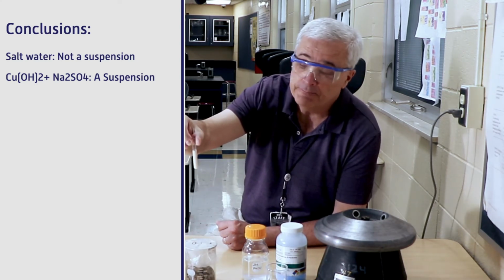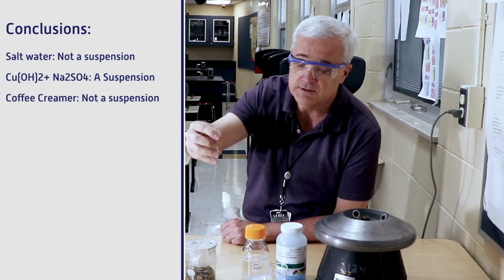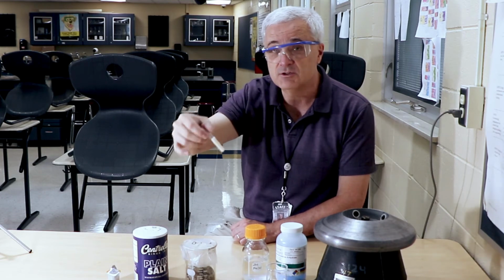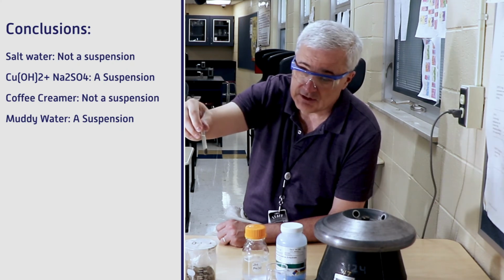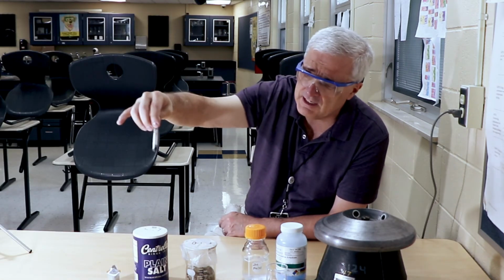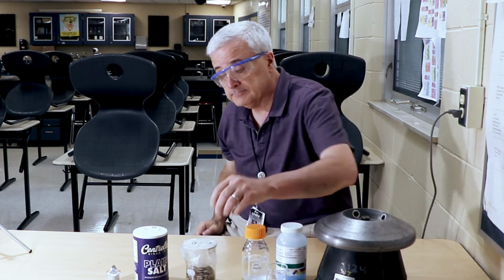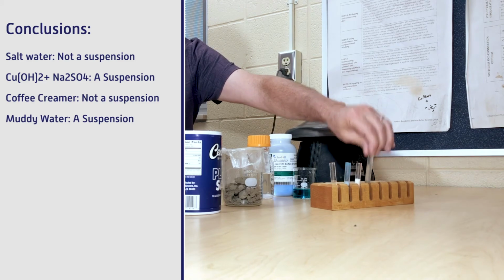The creamer did not separate, and some people would say, well, if you spun it long enough, it would. And there's possibility there are some saturated, some large fat molecules that would eventually make their way to the surface. But in the amount of time that we spun it, it is homogenized, means homogeneous, means that it is not supposed to separate. That's the whole point. And finally, the muddy water was a suspension. And now we have this thing at the top, and then we have the stuff at the bottom. The stuff at the top, we're not sure necessarily what that is at this point, but the large particles settled to the bottom. Also, there's some small particles floating on top. So our conclusion would be: not a suspension, yes a suspension, not a suspension, yes a suspension.